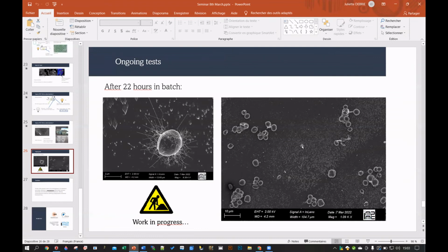Brian, do you know a way to remove the cells without altering the surface? Do you know if there's an easy way to do that? Because I'm not sure. From what I know, there are some organic solvents that dissolve the organics without altering the surface. What I got from Damien is also that with VSI, you may be able to still look at the topography without removing anything. Yeah, that's the other possibility, but I'm not sure with carbon coating.